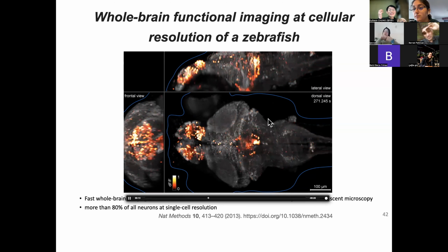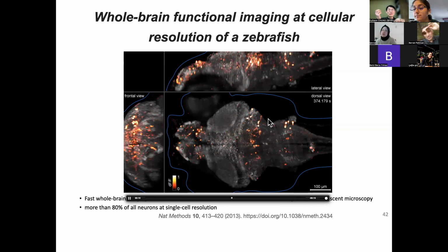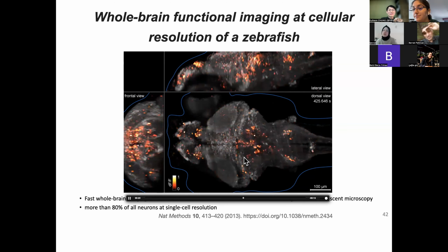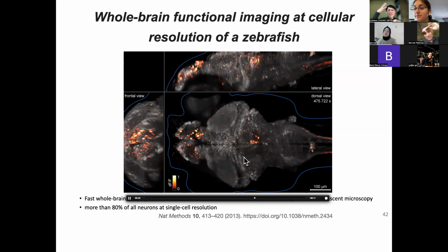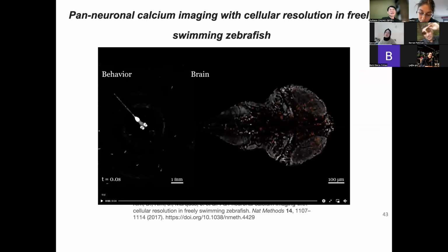But unfortunately, we do not yet decode or understand what's going on. But we do know something's going on. Look at that firing. When we show the zebrafish's eyes some screens and some objects, then the zebrafish whole brain cells respond like this. But this is big. You put the zebrafish in a fixed mode, which, if it were a human, would be a lot of stress. So this was actually 10 years ago.